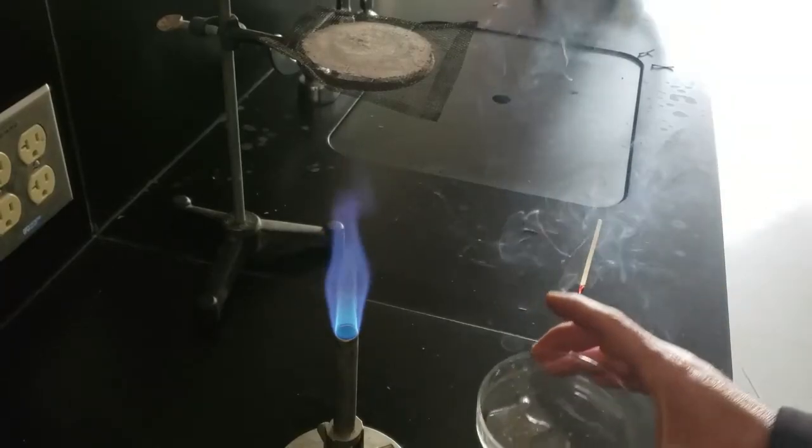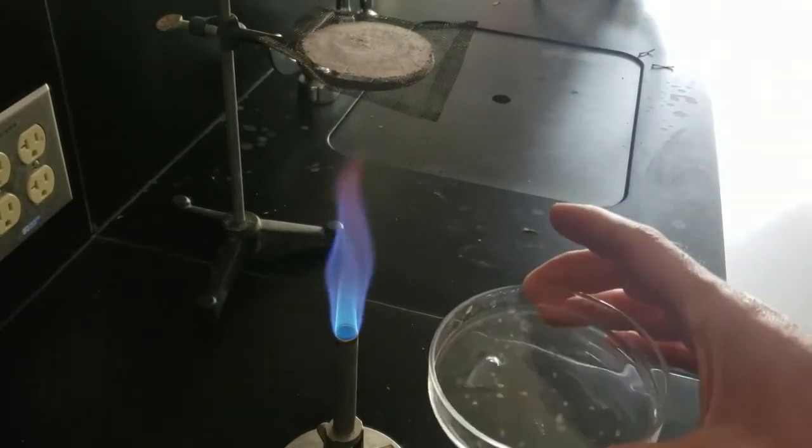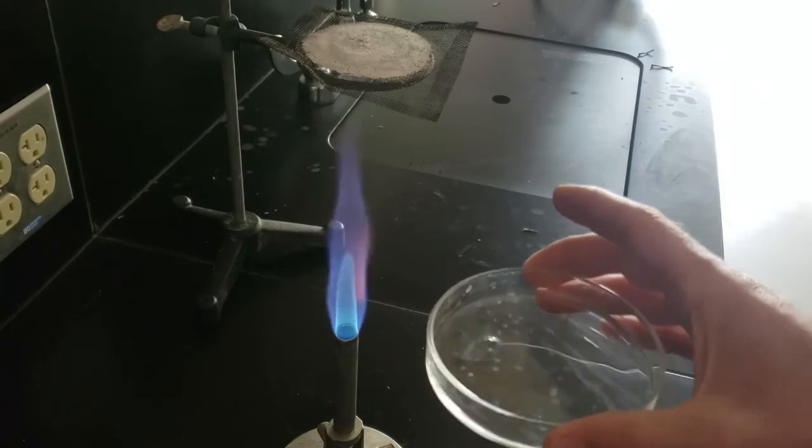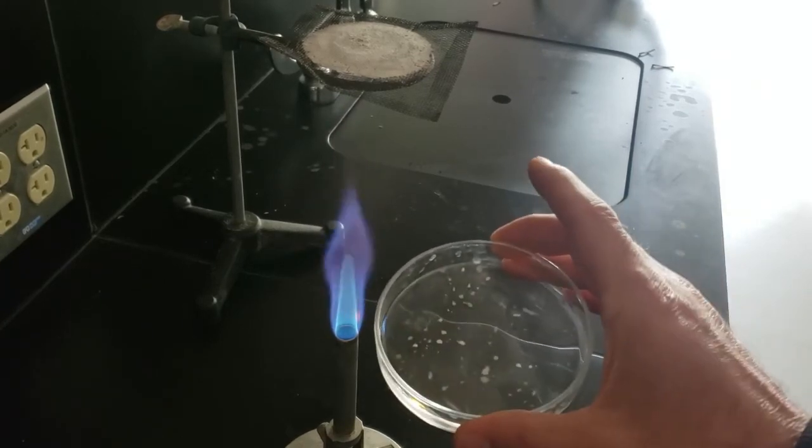So then what I'm gonna do is take what's left over in my Petri dish and put it aside and let it dry so that we can take a look at the crystal shapes when we come back.